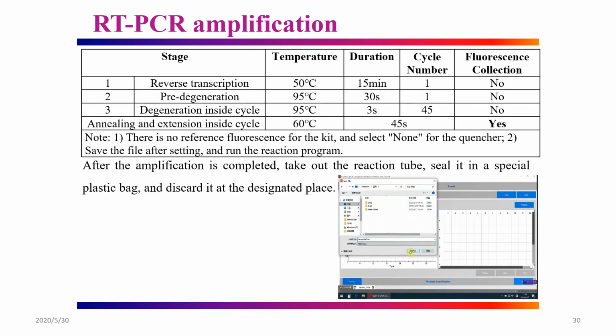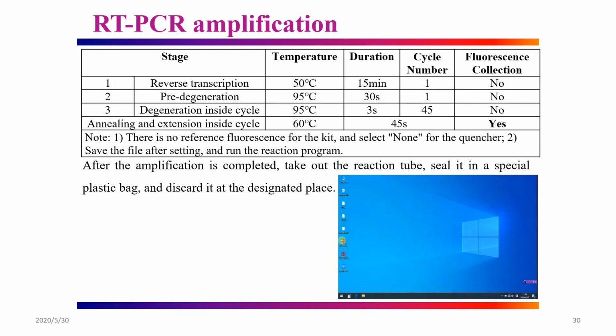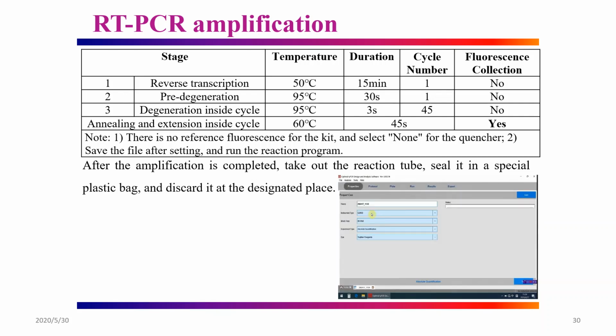When we open this software next time, we don't need to create a new program from the first step. We could directly click the New drop-down key, select the template file, double-click to open the template, and rename a new experiment.